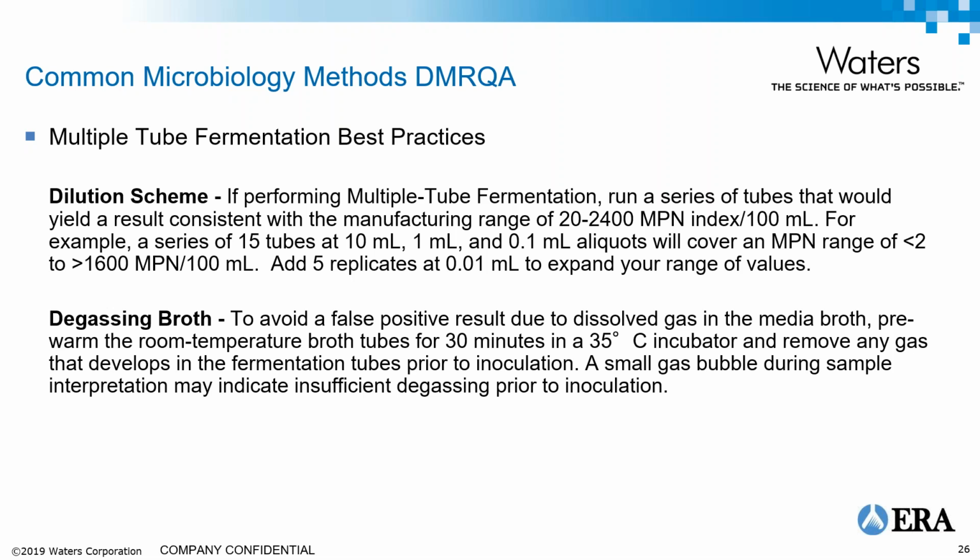or once you do inoculate them, come back to the incubator after about 30 minutes, outgas, and put it back in the incubator. You don't want to have an interpretation of a small gas bubble that is really degassing of the broth to cause you to get a false positive.